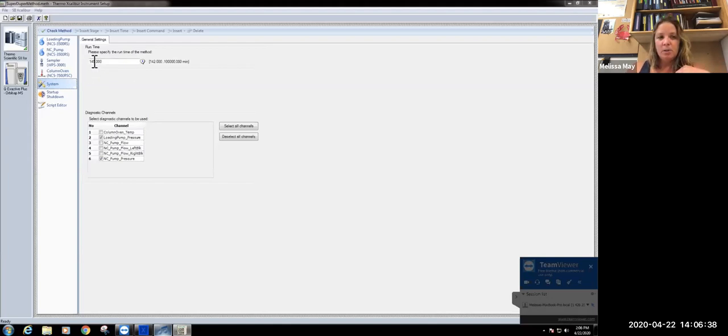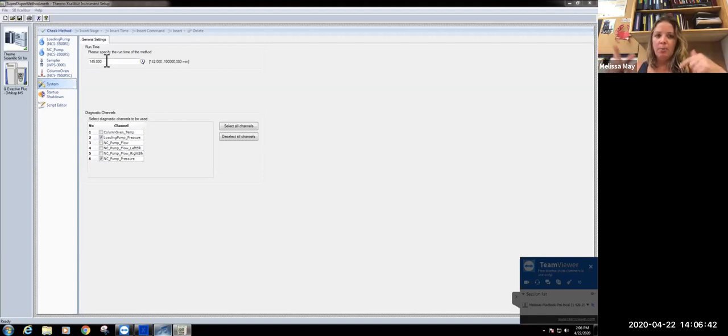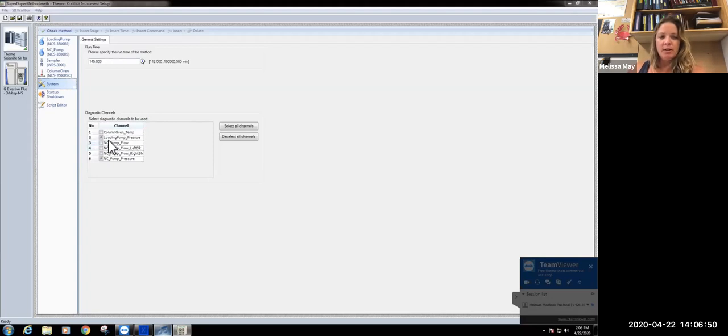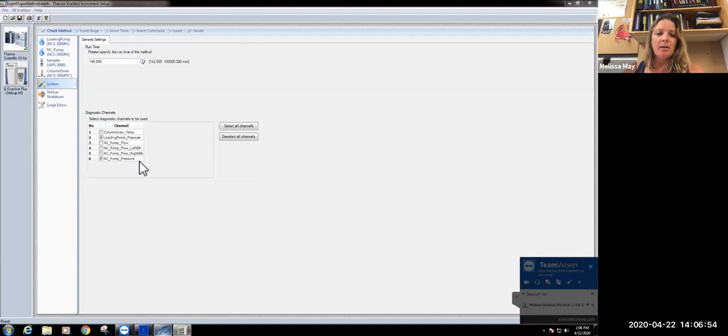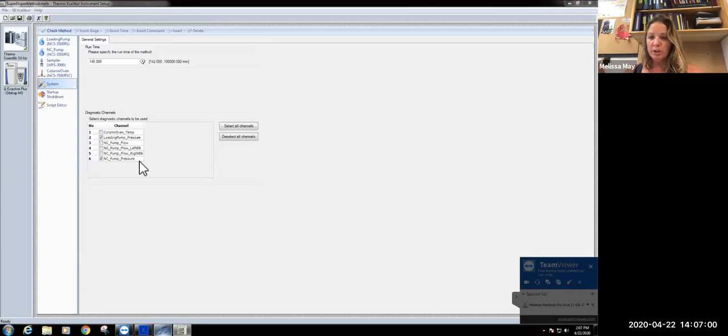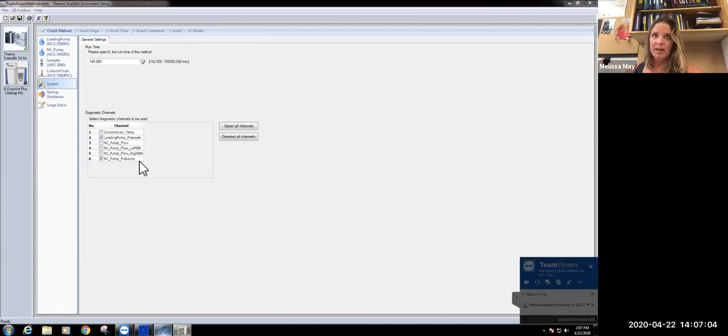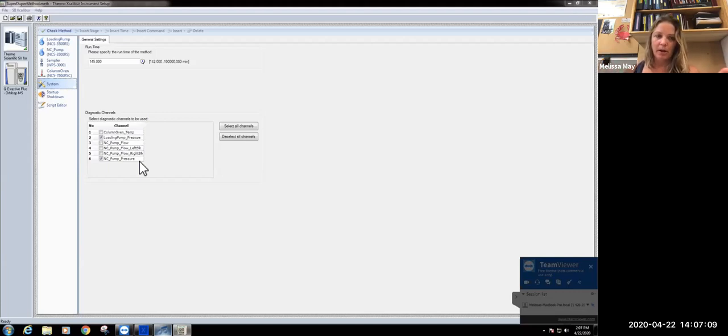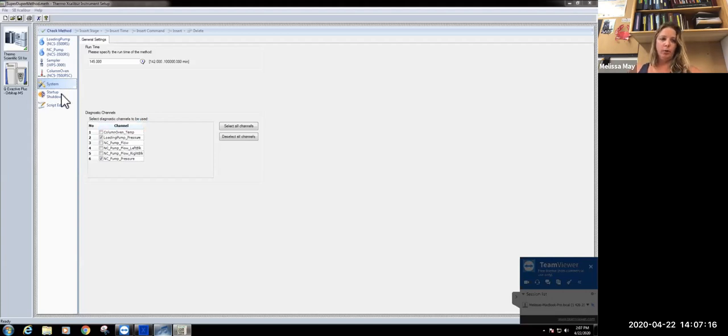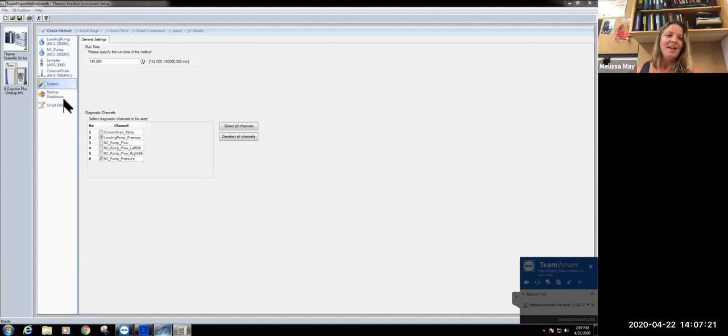Our total runtime is 145 minutes for it to go from start to finish with loading the sample. It takes about 160 minutes, so this tends to be a little bit longer. The only channels I have saved are the loading pump pressure and the NC pump pressure. This allows me to do is after I've looked through my data, I can go through and see whether there were changes in pressure. If you have a big drop or big spike in pressure, that can indicate that there was a clog. These are really good checks as quality control for your data.